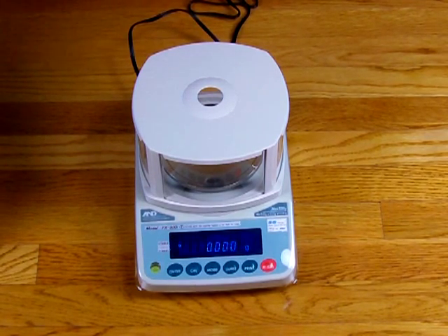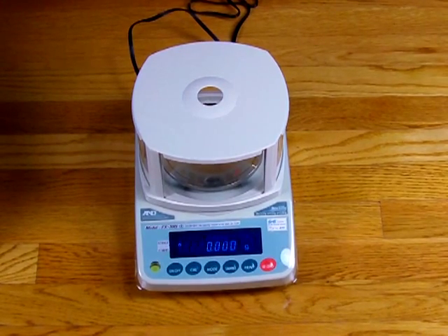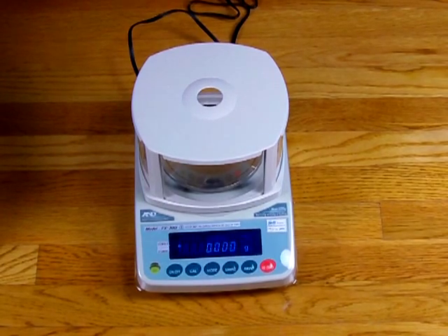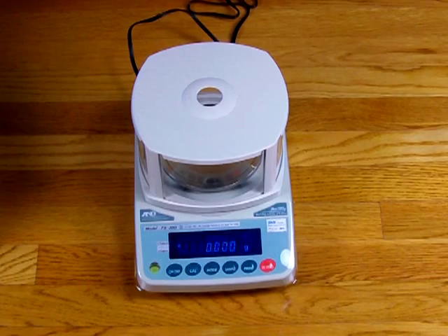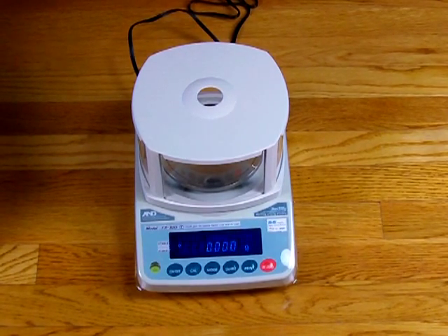Hey, welcome to balances.com. Today we'd like to give you another demonstration in regards to the FXI series from A&D. This is one of our best-selling precision balances. It has a milligram version and a second unit that goes to 0.01 gram. Today's demonstration will be on how to calibrate the FXIN.